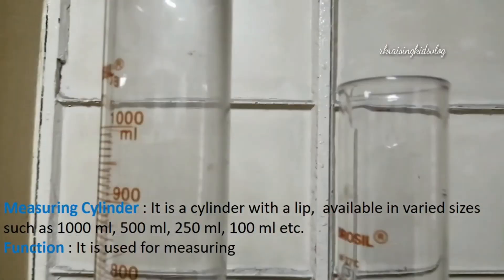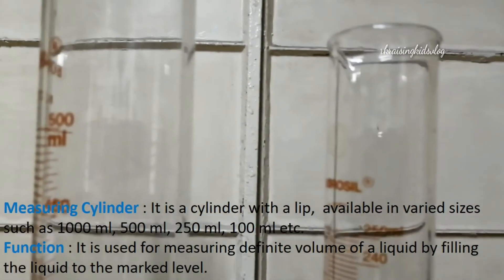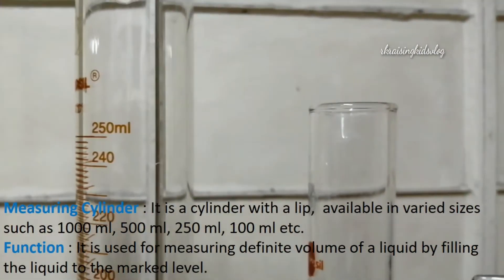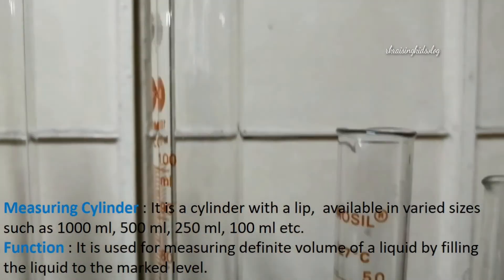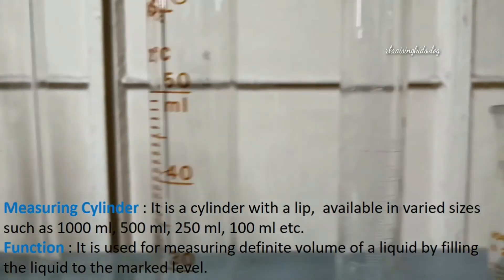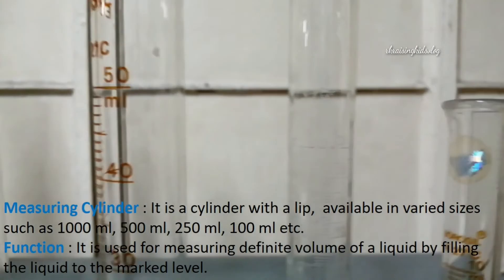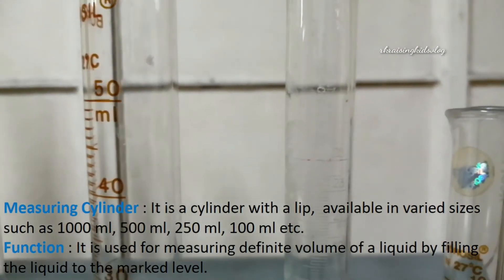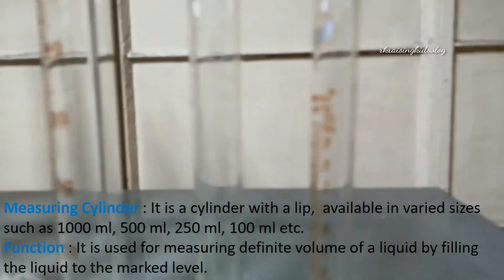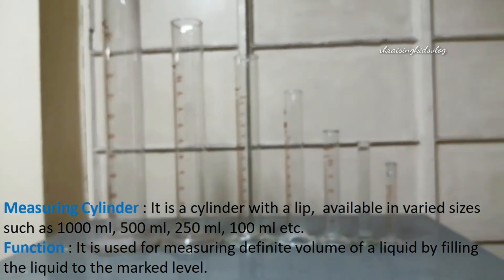Next, we'll know about the measuring cylinder. It is a cylinder with a lip also, available in various sizes such as 1000 milliliters, 500 milliliters, 250 milliliters, 100 milliliters, etc. Here you can see a 500 milliliter measuring cylinder, 250, 100, and 50 milliliters. It is used for measuring the definite volume of a liquid by filling the liquid to the mark level.